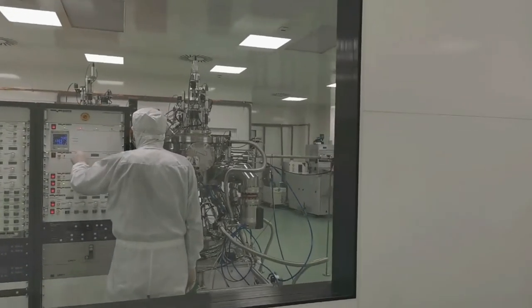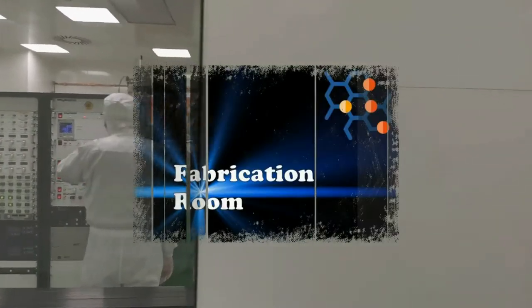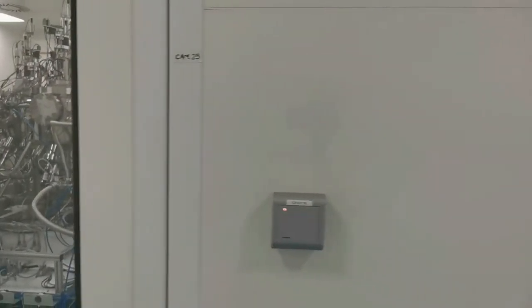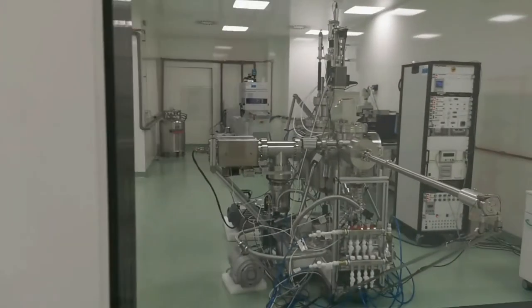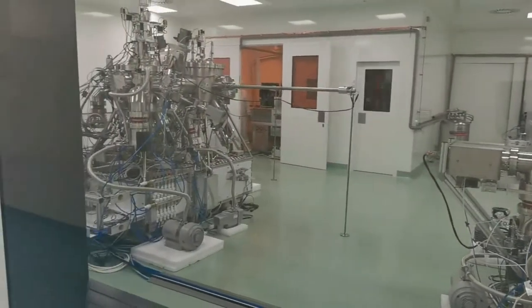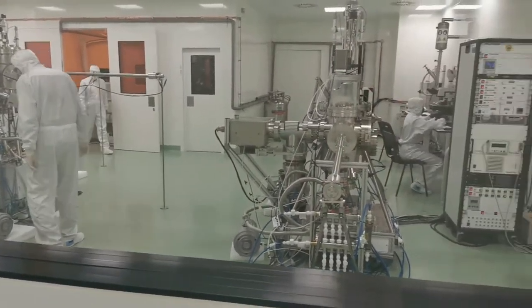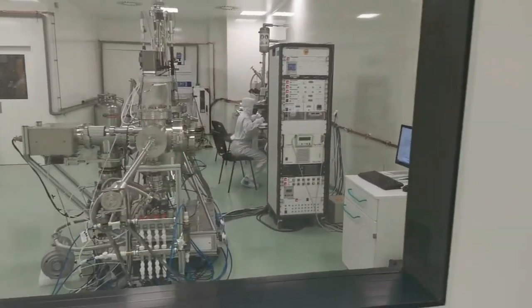This particular lab is dedicated to the development, fabrication, characterization, and micro-assembly of targets for experiments with high-power laser and gamma beams, accommodating a wide range of state-of-the-art equipment and a specialized team of material scientists and engineers.